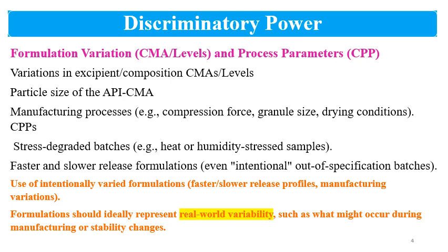One of the most important things here is that the formulation should ideally represent the real world variability, such as what might occur during the manufacturing or stability changes.